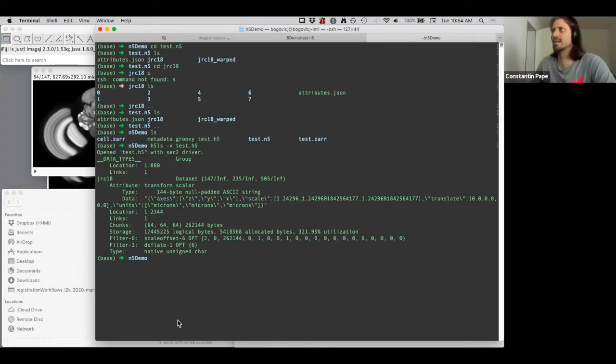Yeah, it has pretty much historical reasons, right? This is all based on Josh Moore's first draft and then expanded, and this is how it was designed. I think the current spec really thinks about handling everything as a multi-scale image, so it doesn't reason at the single array level.